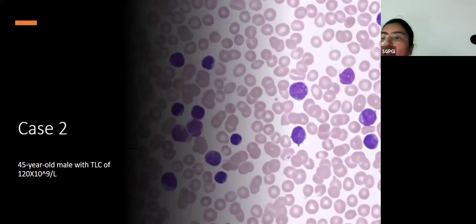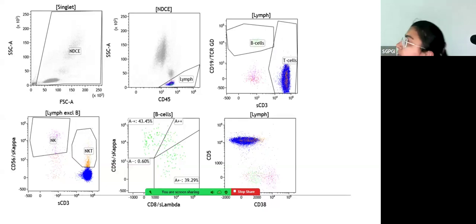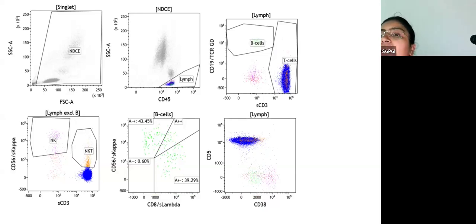With that we move to case 2. This is a 45-year-old male who had a TLC of 1.2 lakhs. If you look at the cells on your right, that was the morphology from this case. This particular patient also had splenomegaly. If you look at the plot, starting from the forward versus side scatter plot, what is the most striking abnormality? You are supposed to have lymphocytes, monocytes, and neutrophils. In an adult male, which should be the most dominant cell? Neutrophils. Here everything appears to be like a lymphocyte. Very few cells in the mono and the neutrophilic region. The forward scatter versus side scatter plot tells you that there is an abnormality.